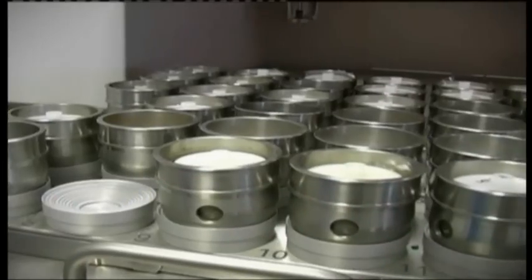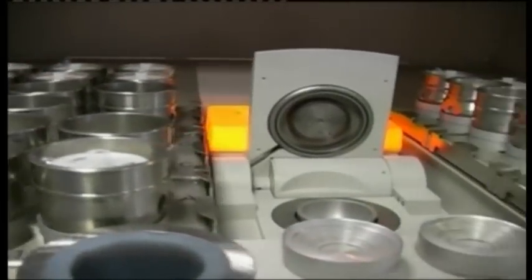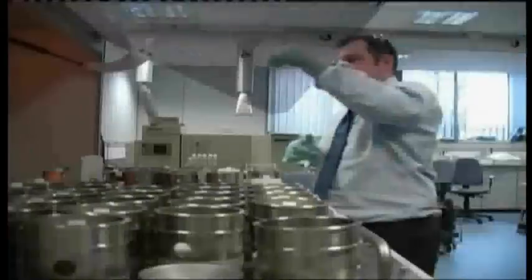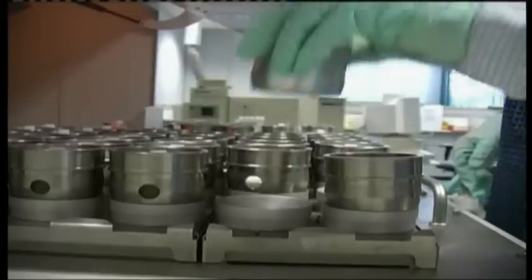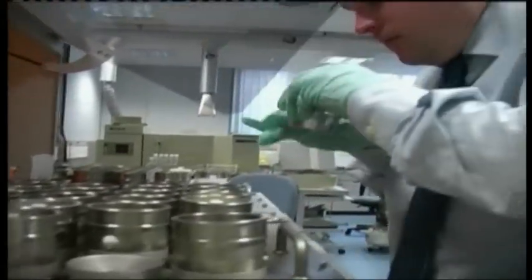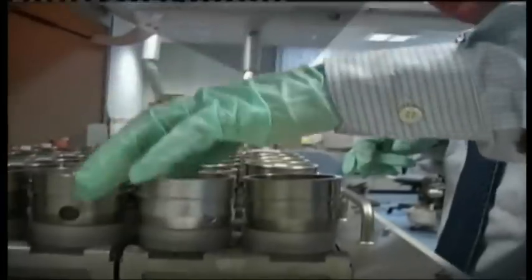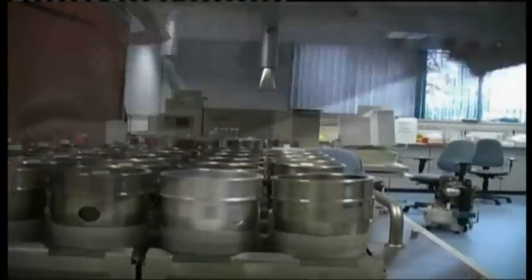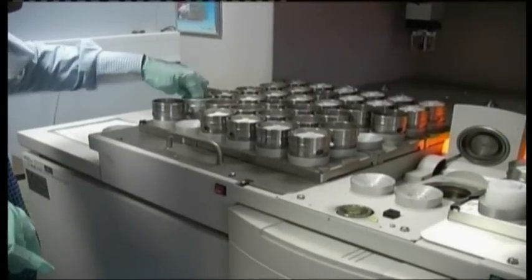6 samples for analysis have been prepared, 3 of the standard sulfur flowers and 3 of Simon's samples. A bit like slides for a microscope, but much more precise. Andy has achieved 2 things in his preparation. Firstly, he has produced samples that are homogenized, that is to say, of a uniform consistency over the whole surface of the preparation. So the X-ray fluorescence spectrometer will have a very even sample to look at.